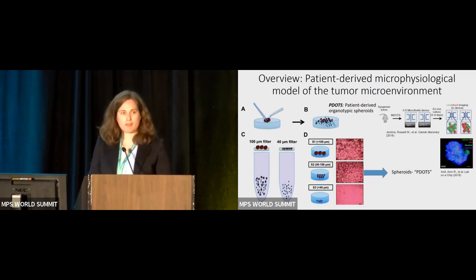And so the Barbie lab at Dana-Farber in conjunction with Kam Lab has already done a lot of work characterizing the PDOTs and also comparing them to MDOTs, or murine-derived organotypic spheroids, and looking at response to immunotherapy, immune checkpoint blockade by doing live dead staining. We've looked at the populations of immune cells in the PDOTs relative to the primary tumor and found that these immune populations match. And so I really wanted to take these PDOTs and then put them in a vascularized model.